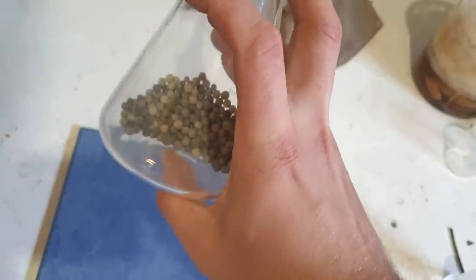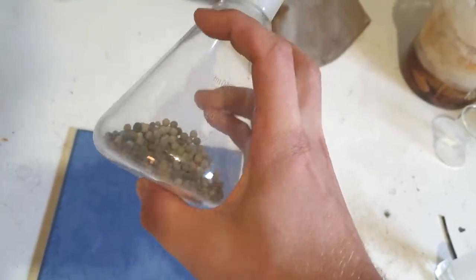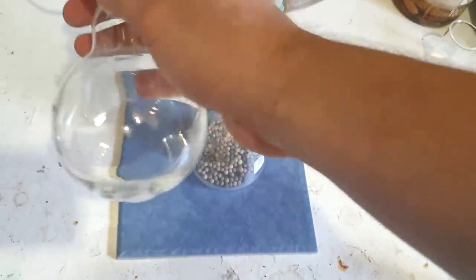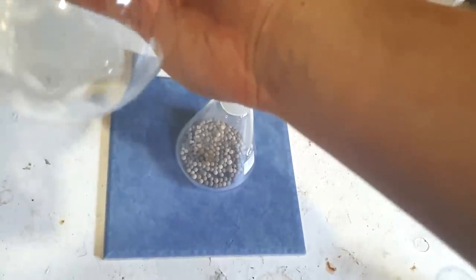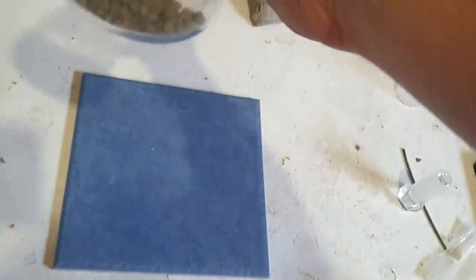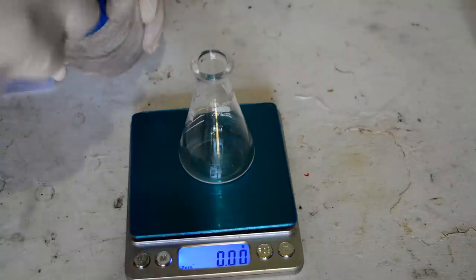What happens is the sieves are so hot that they actually heat up the glass enough that it's slightly malleable, and then you put this sealed flask under vacuum, and it starts to deform. All right. Dreadful. I should not do that. Don't do that. You should be doing this with a round bottom flask. Much better structural integrity because it's all circular, spherical. Doesn't have a flat surface to deform like this. That's pretty terrible. Oh well. At least the sieves are dry.